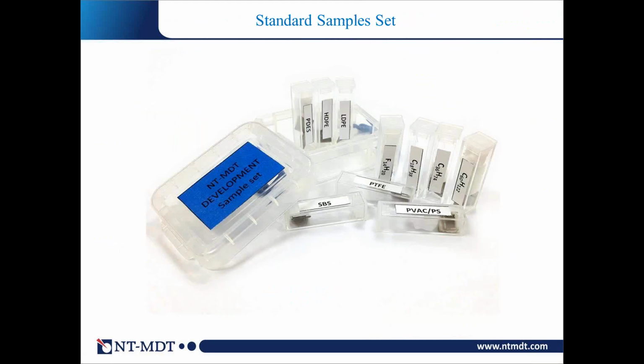And I'll finish by showing that a lot of the information I presented is actually confined to the set of samples we developed through the years. This is a set of samples which can be used to evaluate different modes. Inside the company, we made several sets to distribute, and people can try and learn how to do the particular modes. And with that, I'm coming to conclusions.